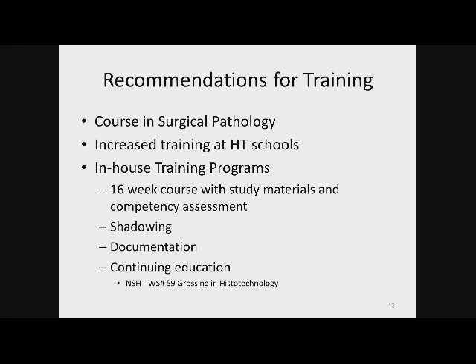So a lot of hospitals, and I'll mention Children's Health Dallas because they have also given a course in training and a couple of different seminars on Histotechs grossing, have developed their own in-house training program. This includes an approximately 16-week course, which includes study materials, testing, and homework assignments. They also want them to shadow either a PA or a pathologist and document all of their training before they're released to be grossing in the gross room.